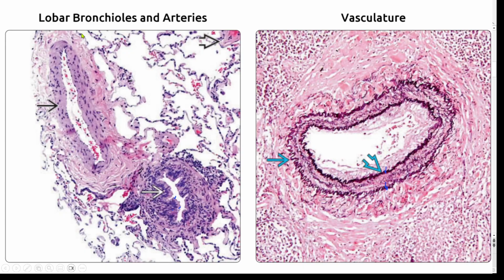Next, we have this lobar bronchi or bronchioles, whatever you want to call it. Probably a misnomer here. Anyway, there is this pulmonary artery, and it's very important to remember larger arteries are adjacent to these bronchioles, starting to become adjacent from the main bronchus, as you can see them in the hilum, and really help to invest the vasculature onto these alveoli, as you can see here. These are alveolar ducts and alveoli. We'll see more of them.